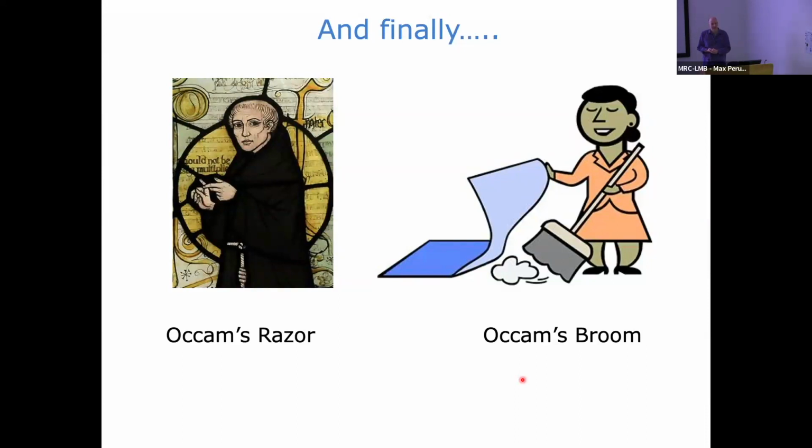Any questions anybody's got? So the question: very often people would want to do ITC and SPR or something, and then sometimes they're within like a log-fold difference, and then people just give that range. Any advice there? In terms of what? In terms of the log? Say, oh, this is between 0.1 and 1. The KD, because one gives 0.1 and the other one gives towards 1. So we say, oh, that's the range between the one and the other.